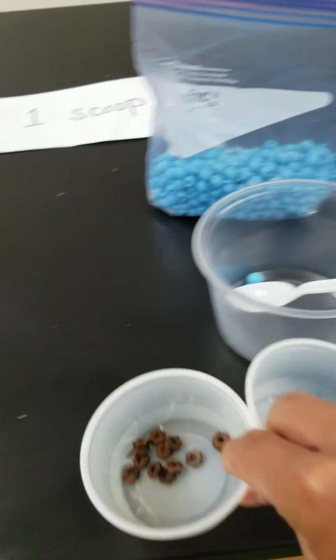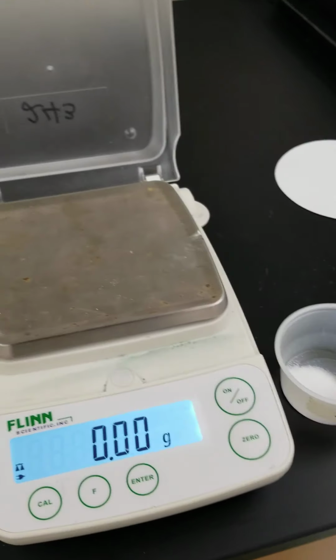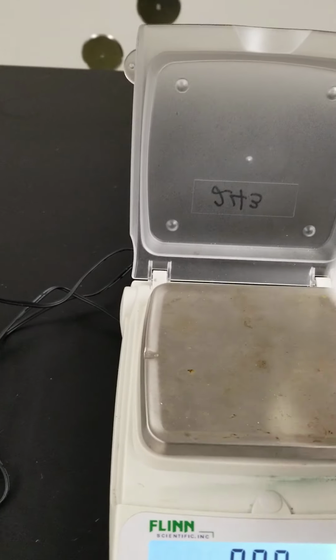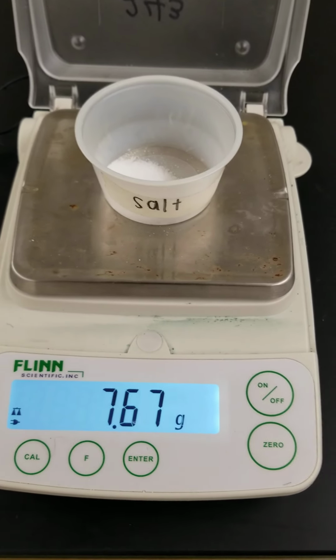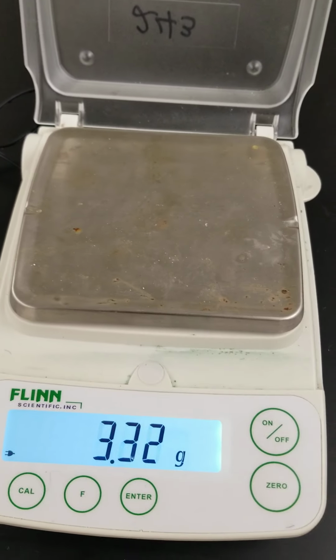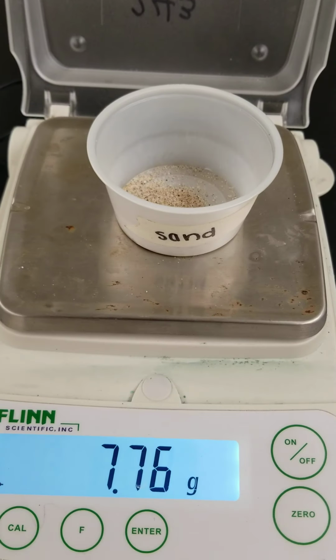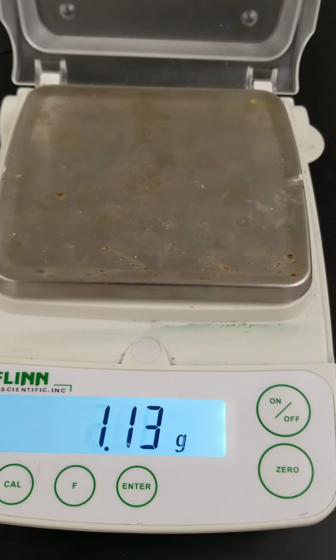Let me move them closer first. Our scale, sorry, so much moving around here. All right, let's keep this in order. So salt, this is the cup with the substance in it, 7.67. Our next one was sand, 7.76.